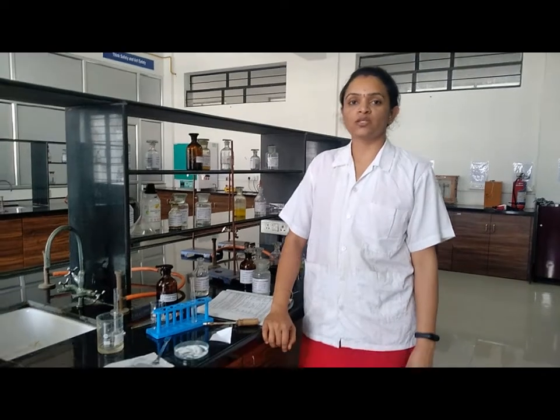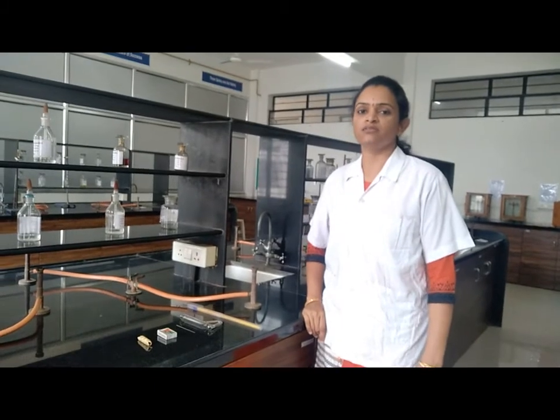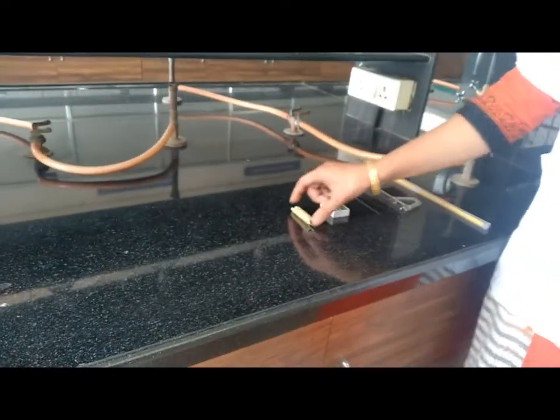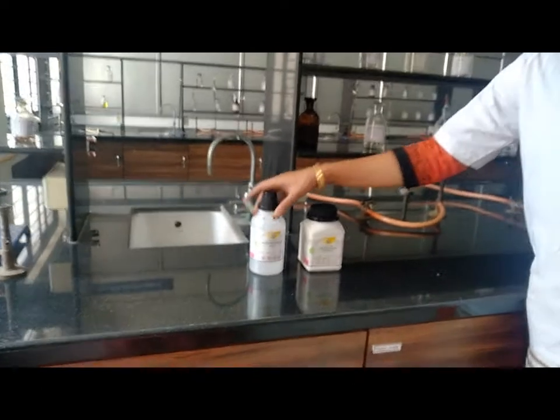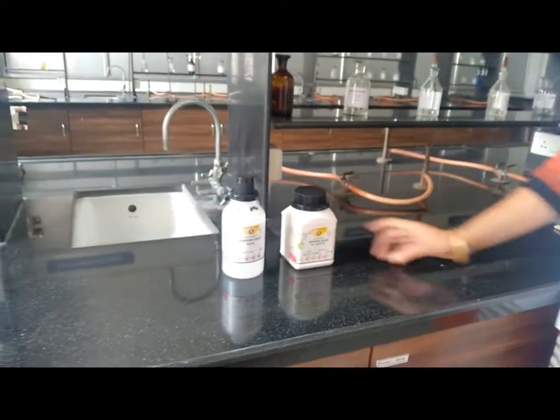Test C, that is determination of melting point, which is useful in the identification test. Let's start with melting point. Let's start with the apparatus required for determination of melting point. First of all, we require a thermometer, Thiele tube, capillary tube, matchbox and thread, and Bunsen burner. And the chemicals required are liquid paraffin and benzoic acid. Benzoic acid is a solid compound which is required for conducting the melting point.